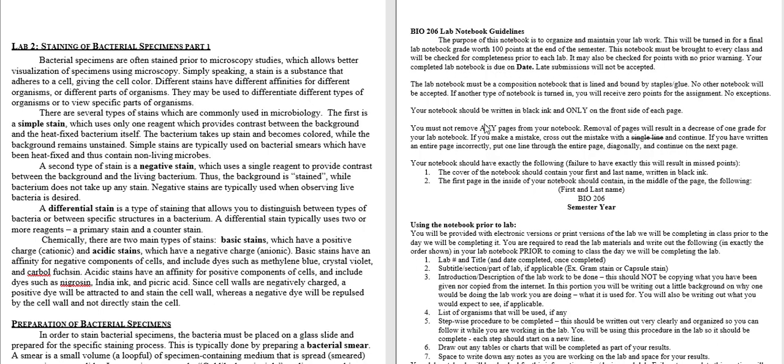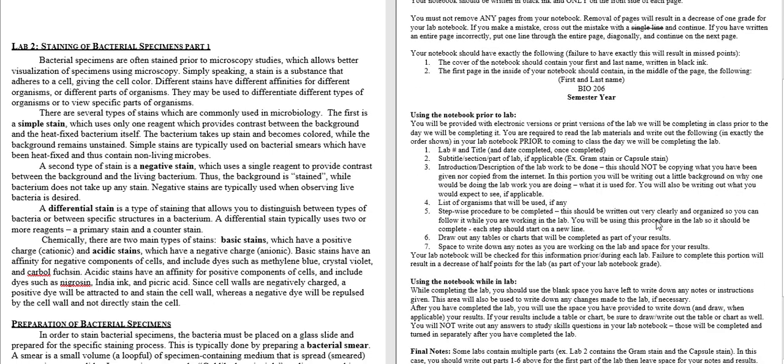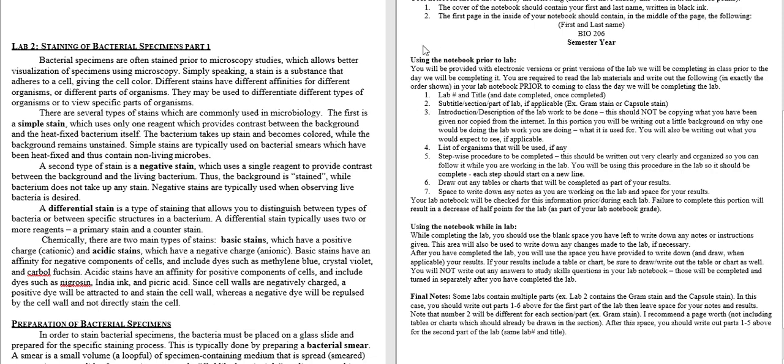So you should have already gone through all of this information, and you can read through this on your own. What I'd like to discuss specifically in this video is using the notebook prior to lab. So again, each week you will be assigned to prepare a lab in your lab notebook. What we're going over is what needs to be prepared. So let's say this next week you have Lab 2 due. So you need to prepare Lab 2 in your lab notebook.